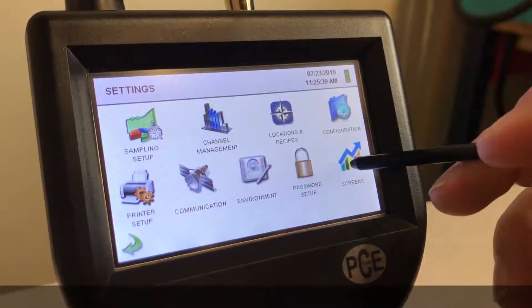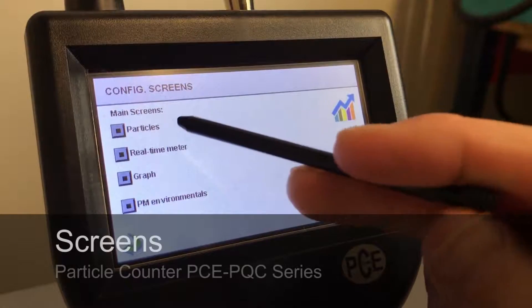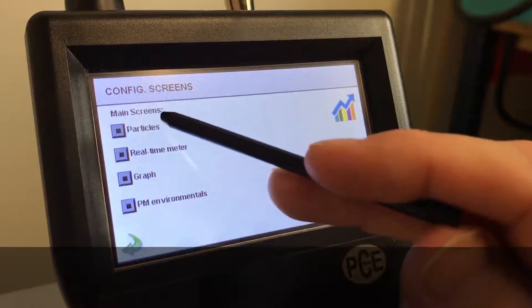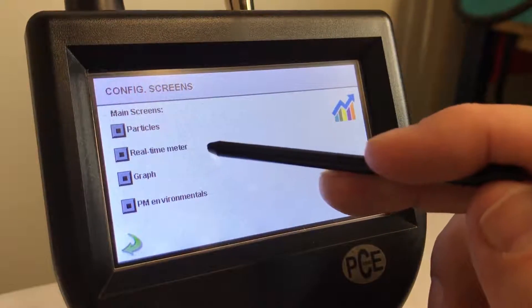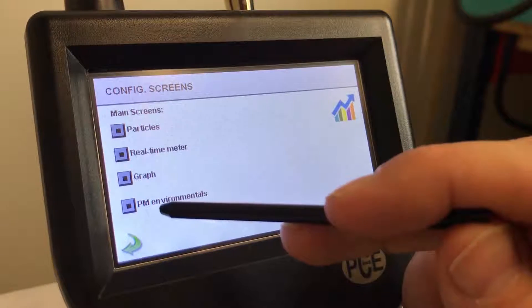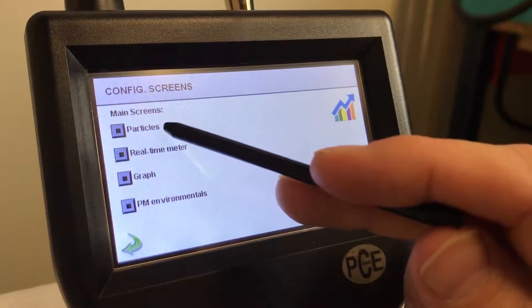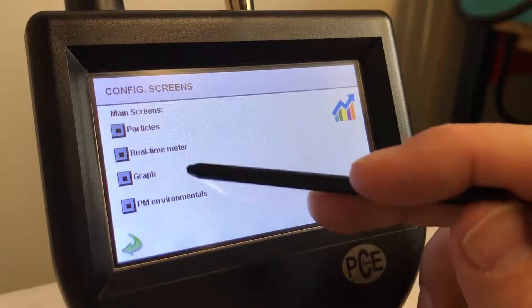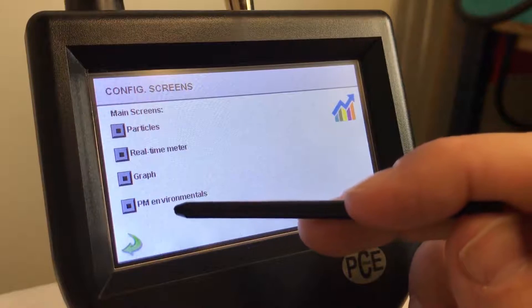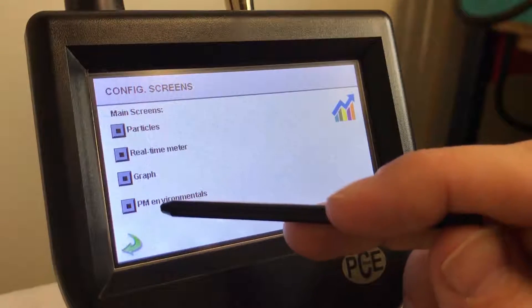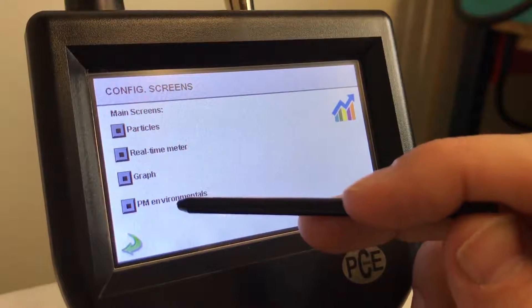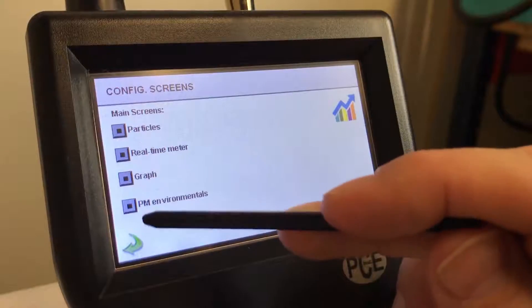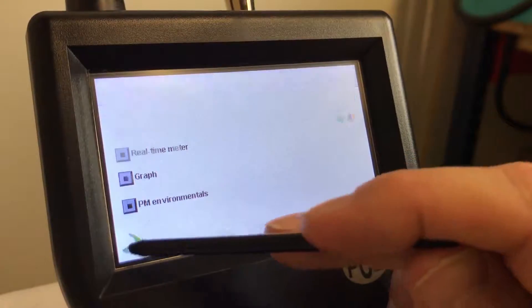Here are your screens. So when it's running a sample, you can choose what you want to see. If you want to see the particles, the graph, the PM environmentals, and the real-time meter, you would just select or deselect that there.